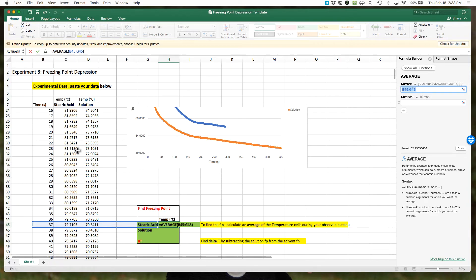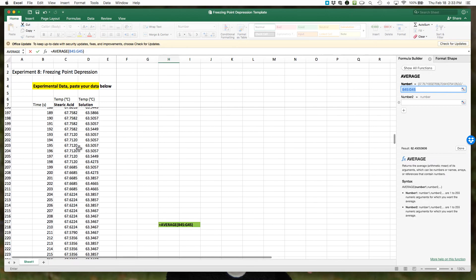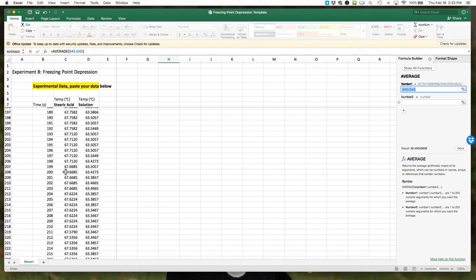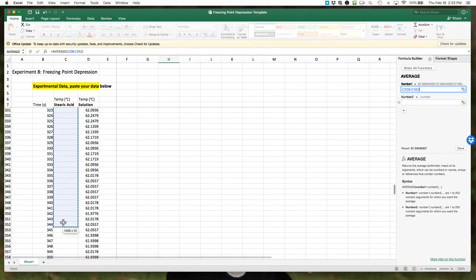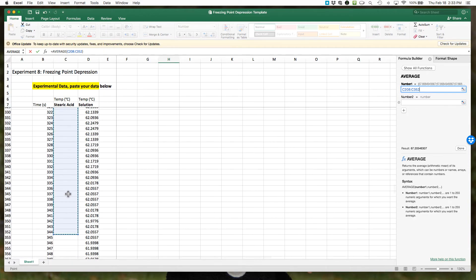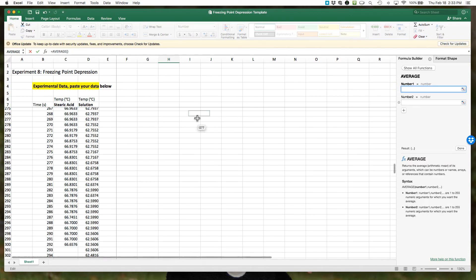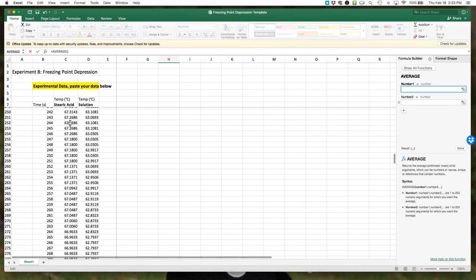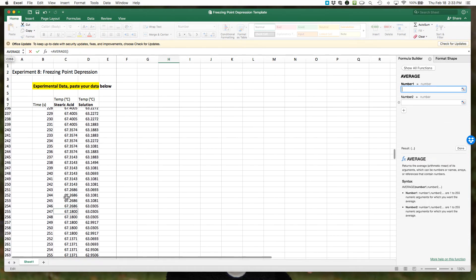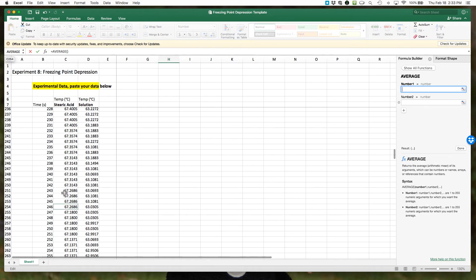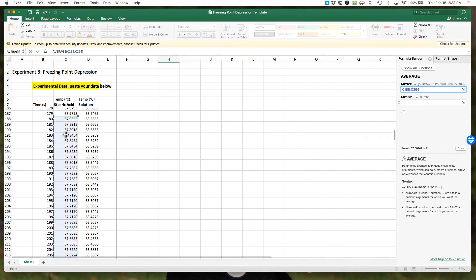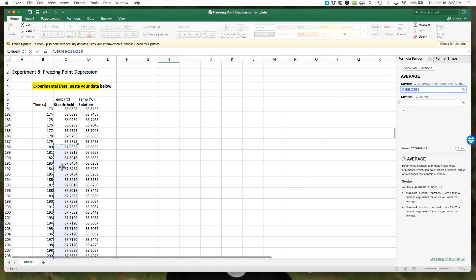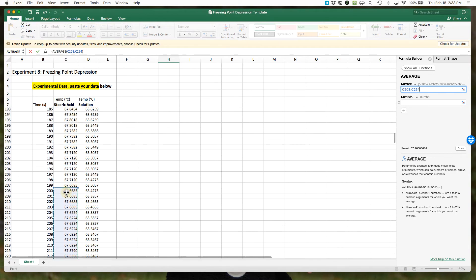Now we just want to highlight the cells we want. I'm going to scroll down. Remember we wanted 200 seconds to 244, so I'm going to come down to where it says 200 seconds, click and hold, and go down. Oops, too much. Let's try that again. If you make a mistake, you can come back to your function builder, highlight it, delete, and then try again. My computer was lagging.